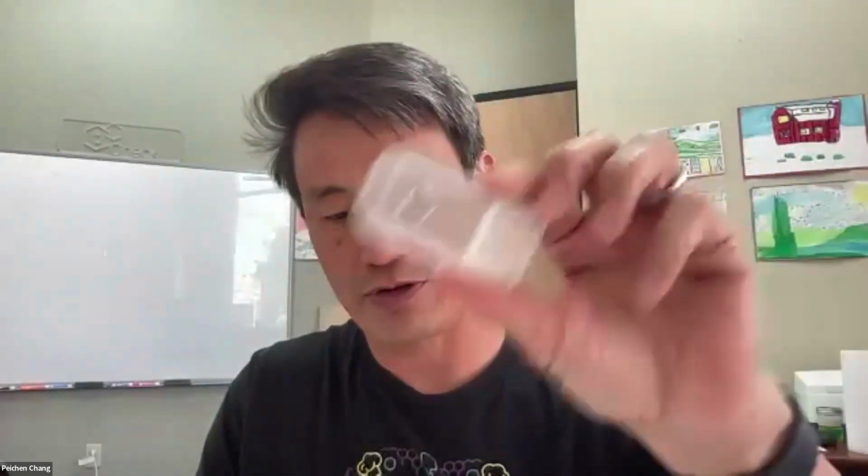Another question of the tray. Can you walk us through the anatomy of the tray for someone testing? Yeah, sure. Okay, so I'm going to find me a good tray. tCheck trays might look pretty simple, but they're actually pretty interesting beasts. We spent quite a lot of time engineering this thing.